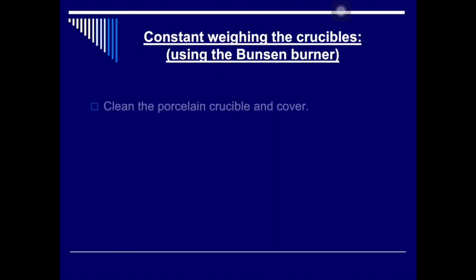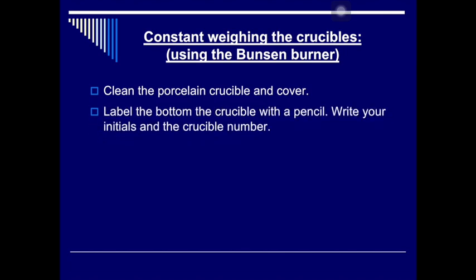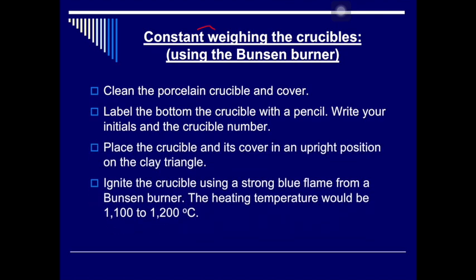So the first thing that we have to perform in this experiment is constant weighing. You only have 2 words here, but these 2 words are made up of several steps. Constant weighing means all these steps all together. And the next slide.